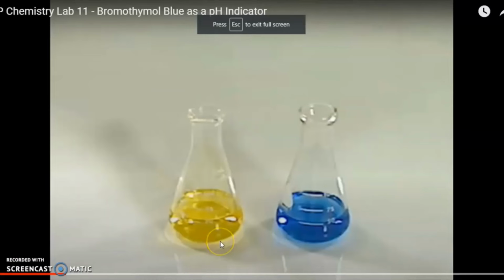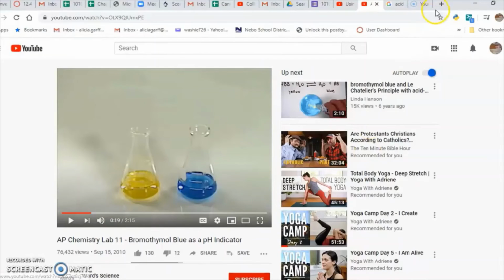This shows an indicator called bromothymol blue, and the flask on the left that's yellow, that flask is acidic, and bromothymol blue is yellow when it's in an acid, and the flask on the right is basic. So when bromothymol blue is in a basic solution, it turns blue. All right, and there's a bunch of different indicators. Let me show you the types of questions you need to be able to answer with indicators.